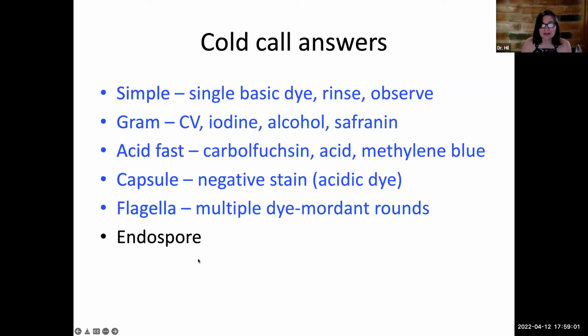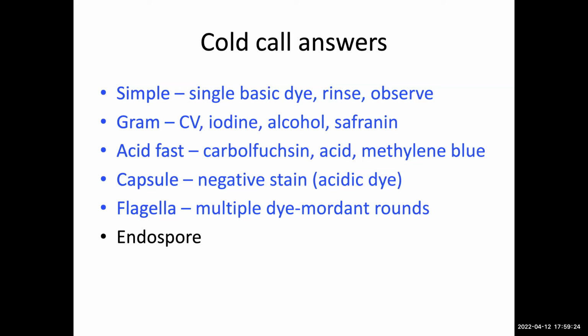All right, Kelly also gave us a great head start with the endospore stain. She said that there was heat and malachite green as the first step. Anyone who remembers any of the other components of this stain, go ahead and raise your hand. Anything else you'd like to say, like what's the counter stain or anything like that? Leslie, go ahead. Is this a counter stain?